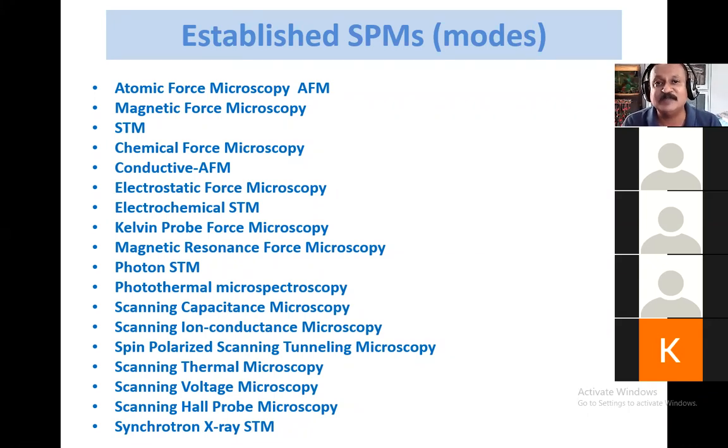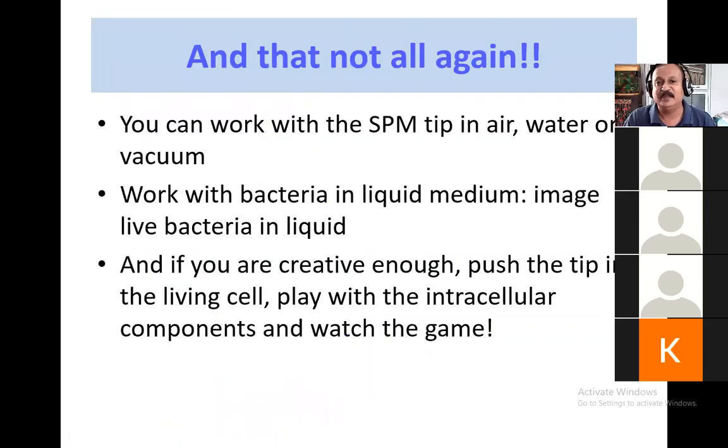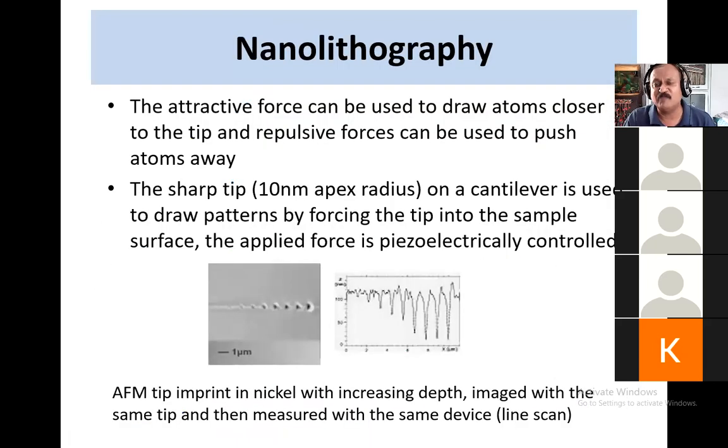Do you understand what I'm saying? Yes, sir. This is not only a microscope for observation, this is also a device for manipulation, and it is also an analytical instrument for carrying out different types of spectroscopies. Is it right? Okay. And then I think I wanted to tell you something.